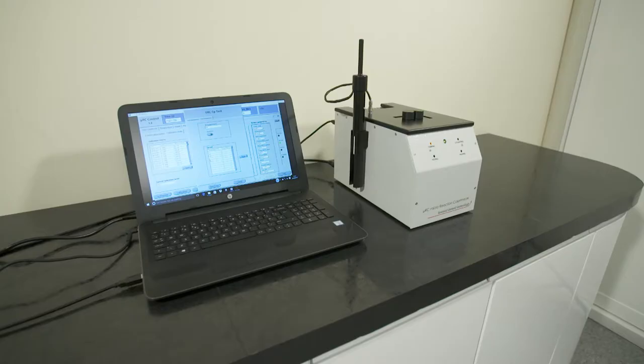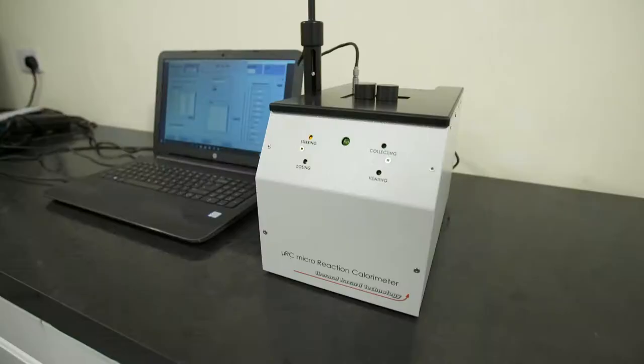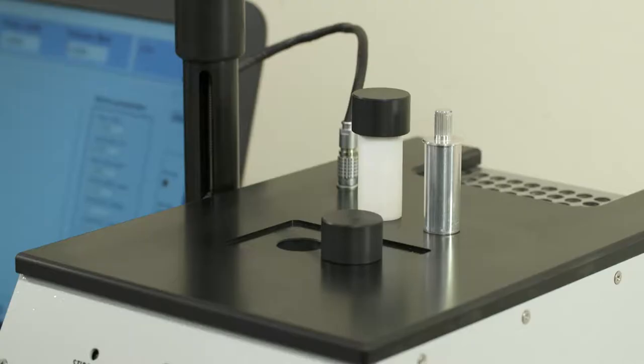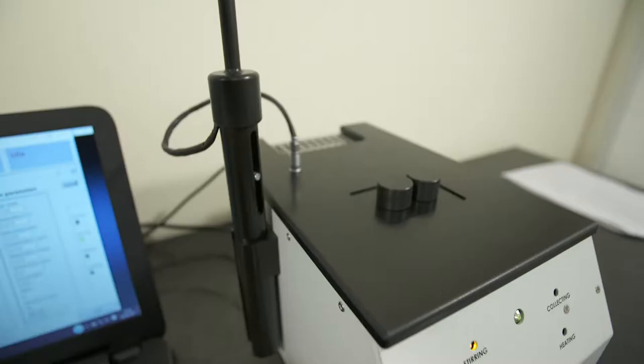The URC Micro Reaction Calorimeter is a multi-function power compensation calorimeter. It offers isothermal, scanning and titration calorimetry all in one instrument with disposable 1.5 milliliter glass vials.